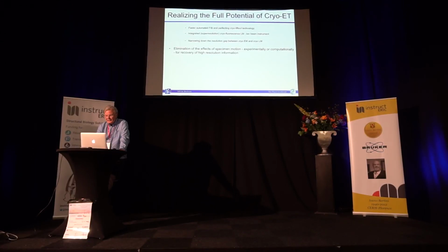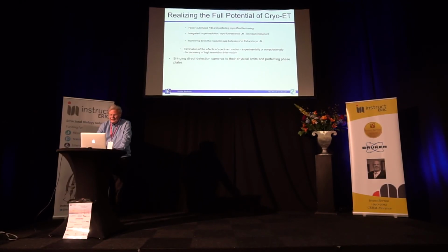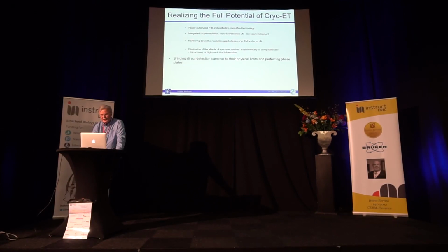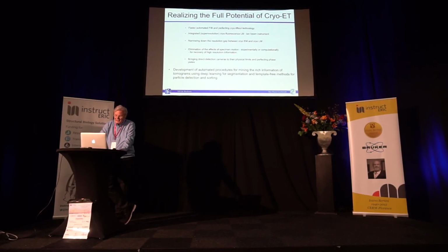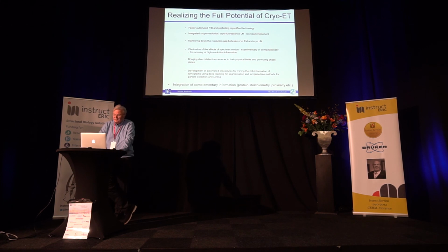I think still a factor that limits resolution is specimen motion. We have to deal with that either experimentally or computationally. Again, the direct detection cameras are not yet at their limit, but there's work going on for the next generation, improving them further. I think we need improved methods for mining the rich information of tomograms using deep learning, template-free methods for particle detection, etc. And last but not least, the integration of complementary or orthogonal information.